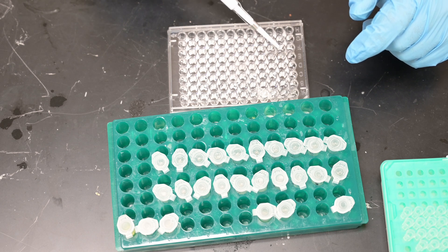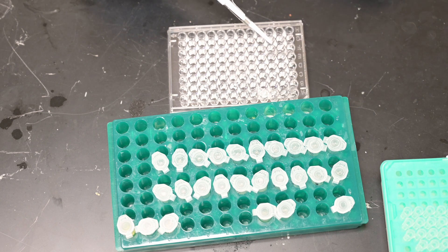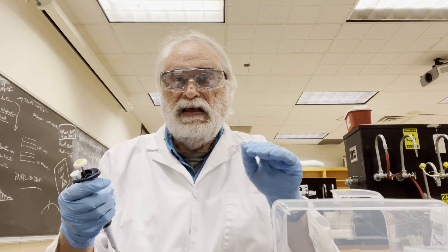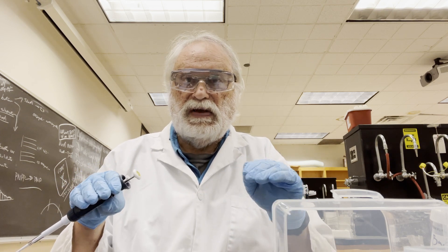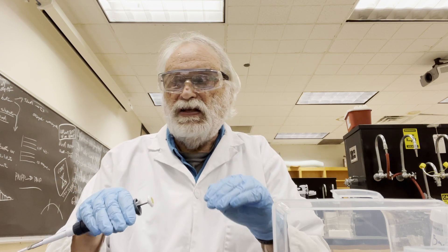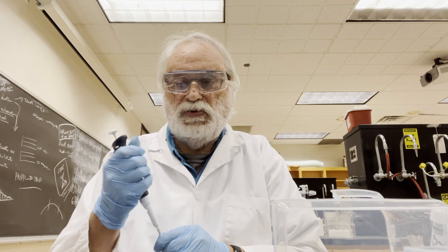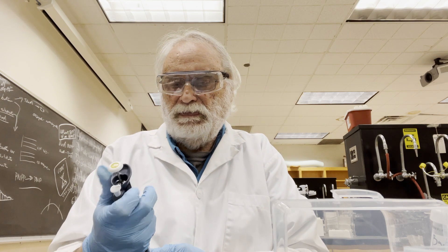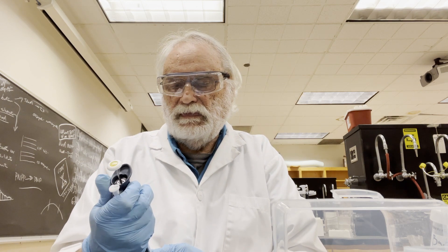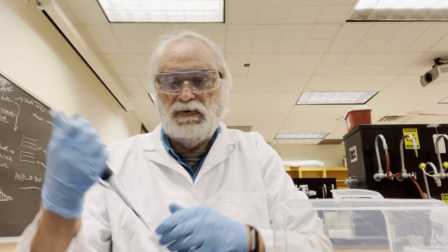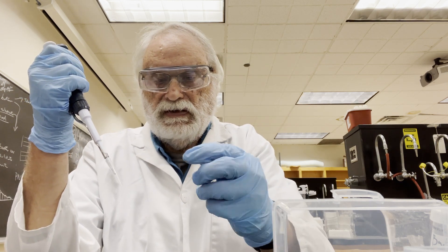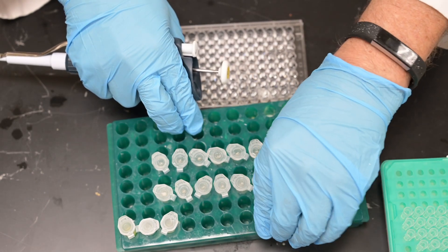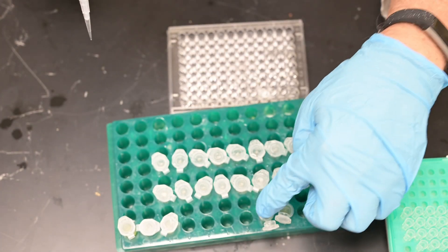These dilutions are just to make sure we can get all samples within the assay range. The assay differences between the protein assay and the enzyme assay mean I'm giving everything the same treatment so we have a better chance of getting all the data we need. Next, I'll load 20 microliters of the load fractions — I'll open both of these up — and those go into F4 and F5.